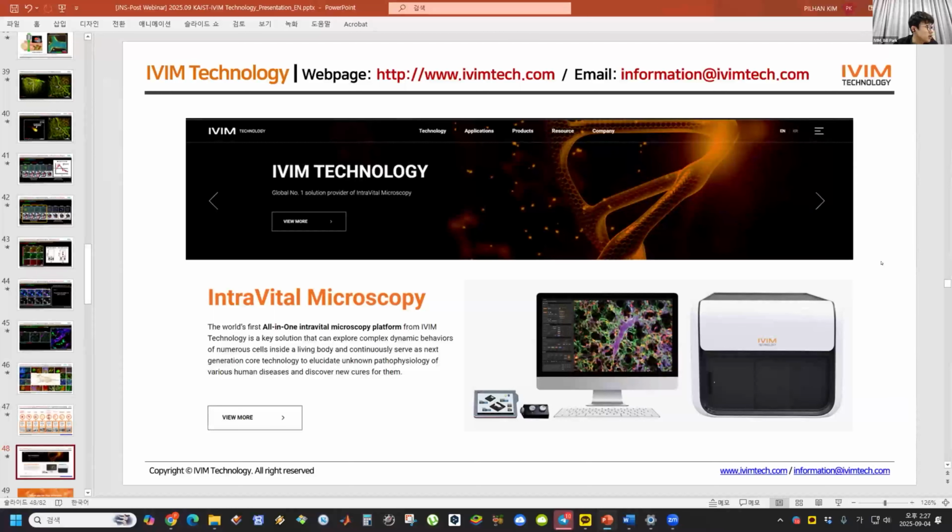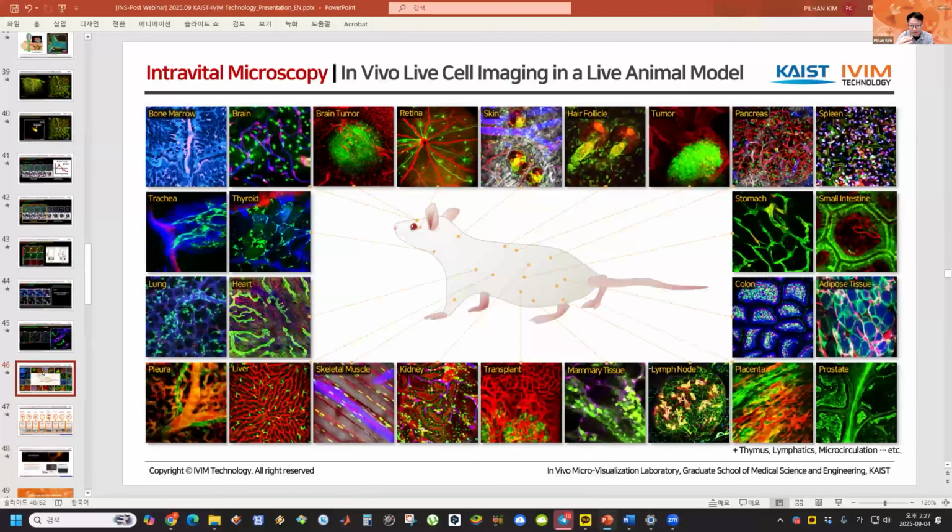So, the first question is, you mentioned that you're using the anti-CD31, but how do they carry out the staining in blood vessels and other cells? Okay, so first of all, we purchased the CD31 antibody, and we have the antibody fluorophore labeling kit available in our company.